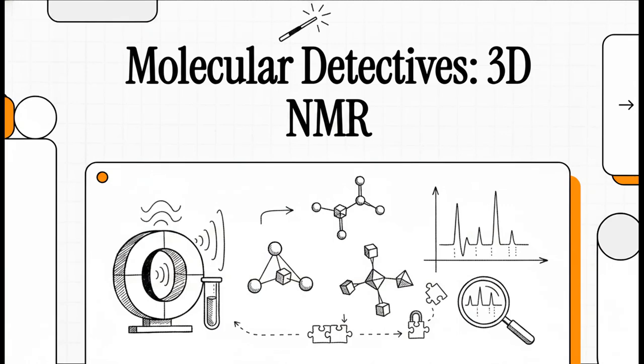Welcome to this explainer. Today, we're diving straight into one of the absolutely coolest magic tricks in all of organic chemistry, figuring out complex, 3D molecular shapes from flat, 1D NMR graphs. We're going to see exactly how chemists use chiral resolving agents and the Mosher method to lock down both relative and absolute configuration. If you've ever wondered how on earth we can see the exact 3D orientation of microscopic atoms using literally nothing but magnetic fields and radio waves, well, you are in the perfect place.